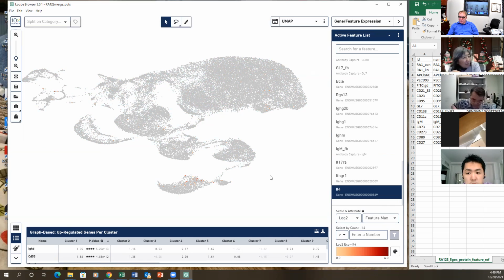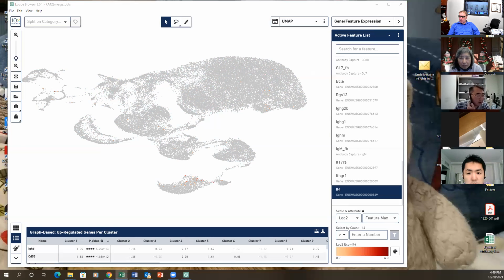So Dr. Mons, Dr. Xu, I don't have some to report today. I haven't got the data for my cells. So this morning I just isolated my PBMC, but I guess the blood is not enough, or some centrifuge issue. So I need to ask Minter to draw blood again, otherwise he will leave soon. So I have to grab him. Okay. So I go back to experiment. Okay. Yeah, sure.